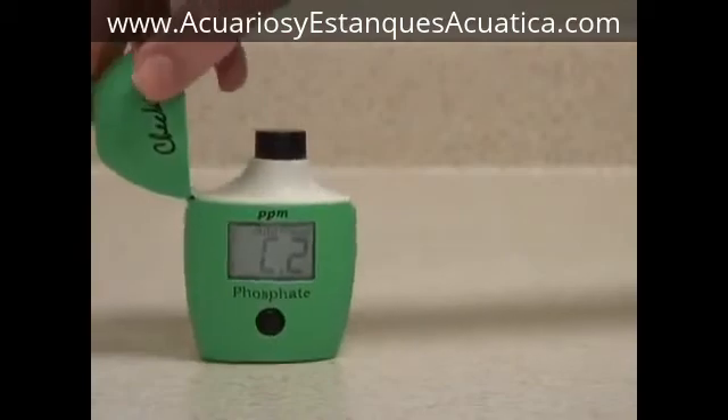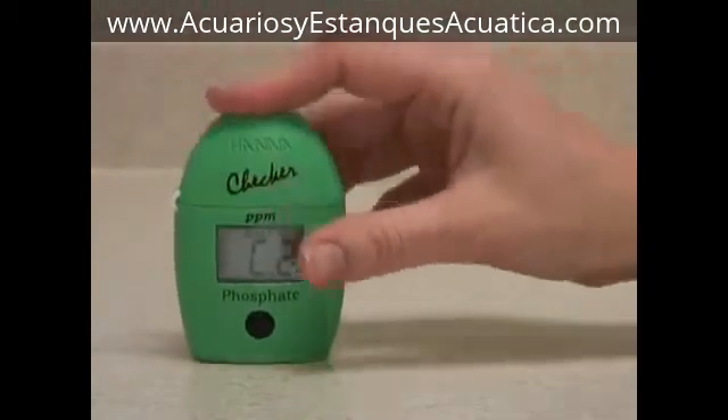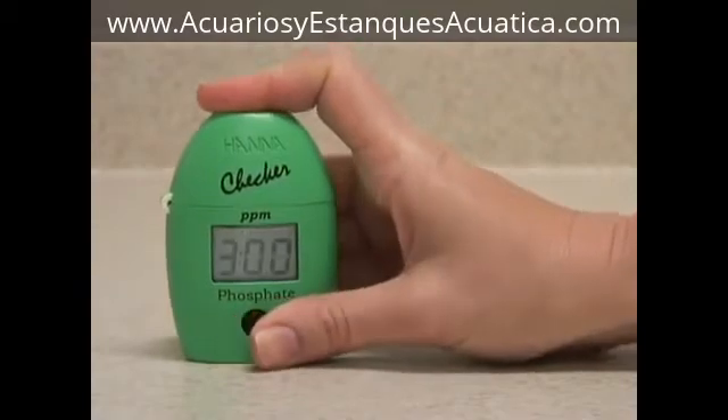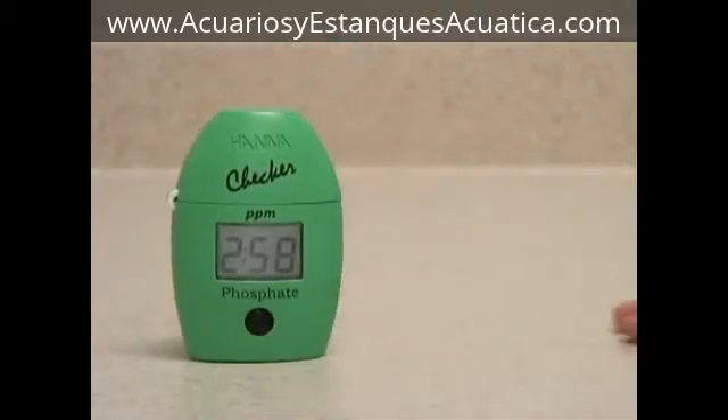Insert the vial back in the meter, close the lid, and press and hold the button to activate the time function. The meter will now count down three minutes for the reaction to take place. After three minutes, it will automatically analyze the sample and display the reading.